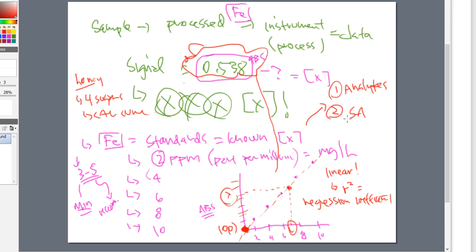So not only do surrogate analytes have to have a calibration curve in order for you to solve concentrations, but some people will also build calibration curves around the internal standards as well. All of these things that you were adding into the sample in order to check the quality of the laboratory workers typically also have to have calibration curves and standards made on the back end in order for you to calculate those concentrations as well.